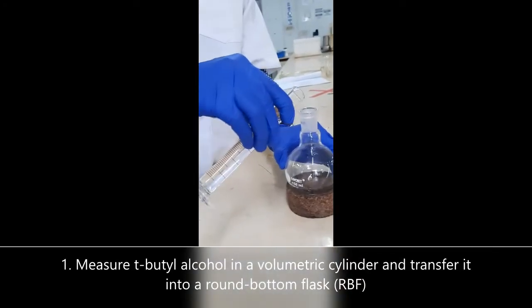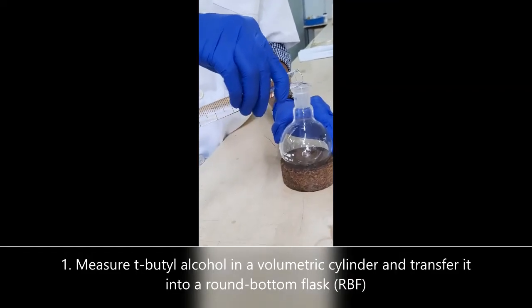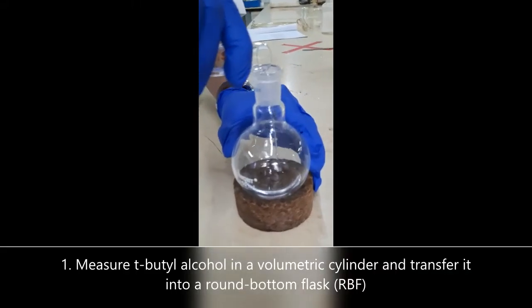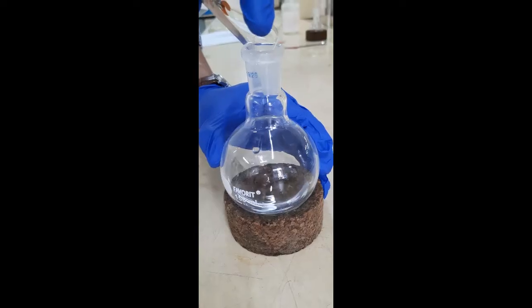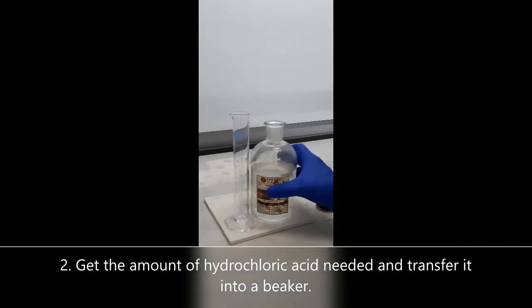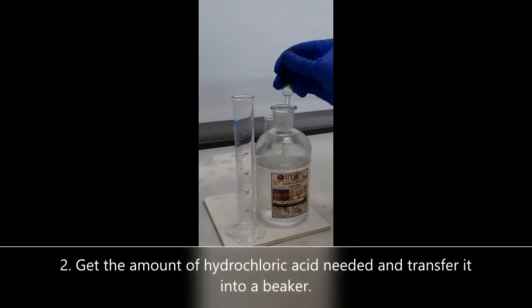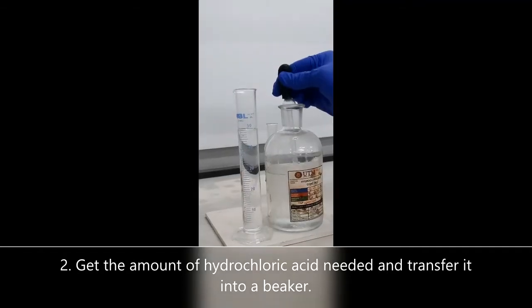Measure tert-butyl alcohol using a volumetric cylinder and transfer the liquid into a round bottom flask. The acid is found in the fume hood. Carefully measure the needed amount using a volumetric cylinder and transfer the liquid into a beaker.